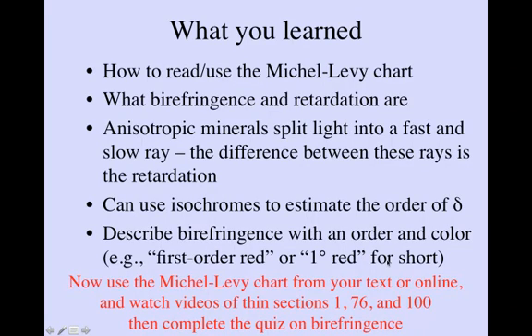Now I'd like you to use the Michel-Levy chart from your textbook or online and watch videos of thin sections 1, 76, and 100, then complete the quiz on birefringence.